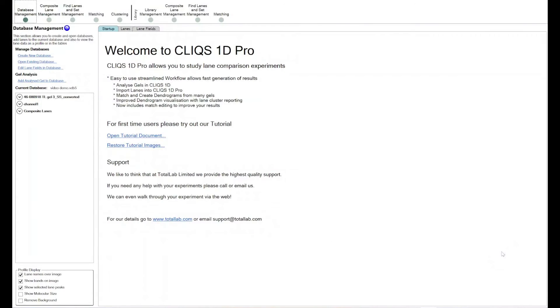Say you're in the position where you just want to take a couple of lanes from one gel blot image and compare them to another couple of lanes on another gel blot image — a really simple comparison. You don't want to create a synthetic lane or do any composite lane management. I'm going to show you how to do that simply and quickly using CLIX1D Pro.